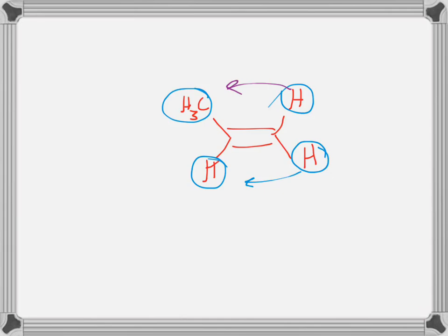Where does this become even more fun? Let's count the neighbors for that now purple hydrogen. It has 2 neighbors, so what's the splitting pattern? A doublet of doublets. Why?